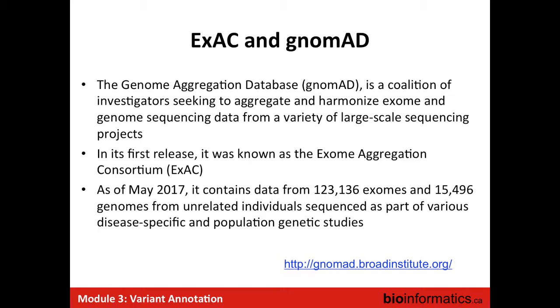So it's a lot like interpreting calls from the database of variants. You want to see multi-platform calls of that variant, ideally, as opposed to a single platform always calling that variant. This gives you confidence that the variant is real. Typically here, we're using it to say it's not been observed before. So if you're looking for something that's not been observed before, that's a useful resource. That's typically the way these databases are used in this case.